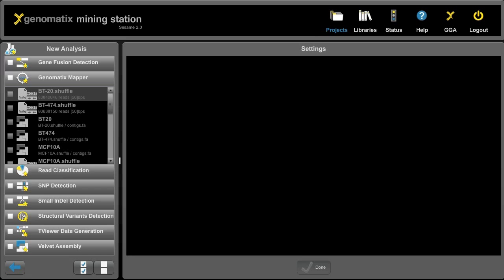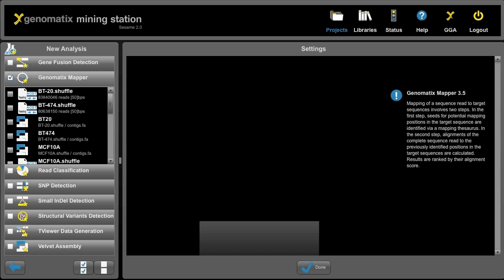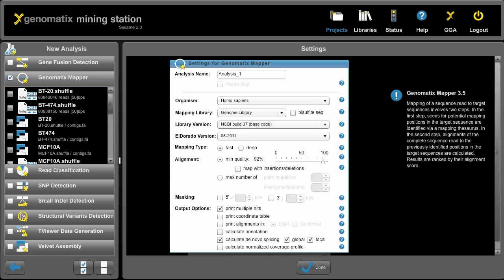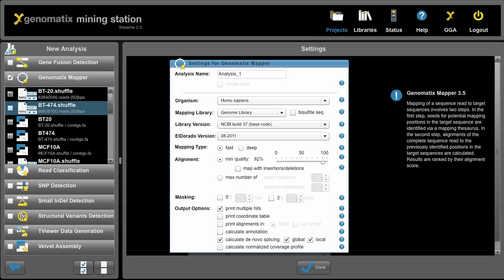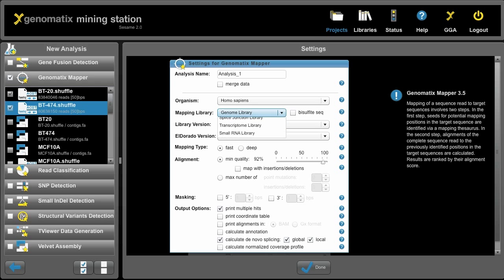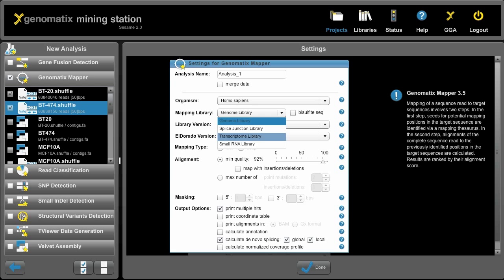For now let's select the Genomatics Mapper and let's say we want to map the BT20 and the BT474 cell line. We click both and then to the right we can select the parameters, for example the organism, the mapping library. Now here for RNA sequencing data we might want to map against the genome, against the splice junction library or against the transcriptome library, depending on the downstream analysis.